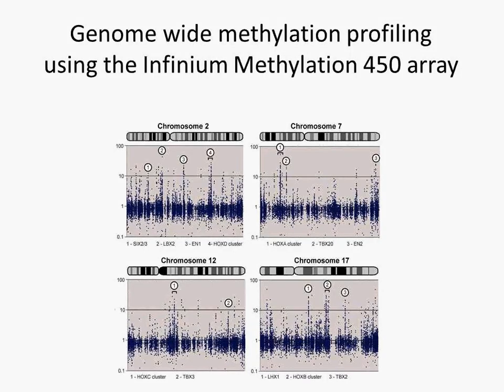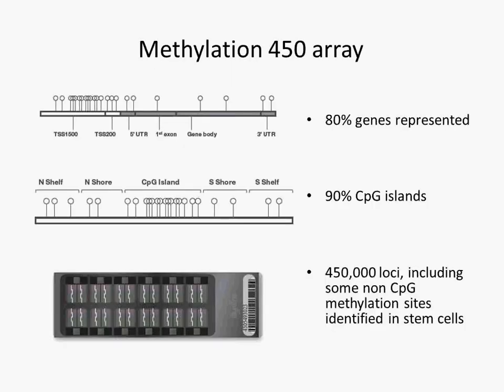So I am now switching to the genome-wide methylation profile using the Infinium Methylation 450 array. We use the Methylation 450 array from Illumina.